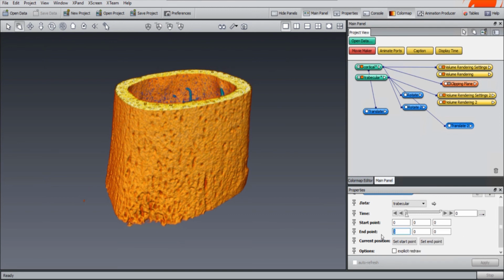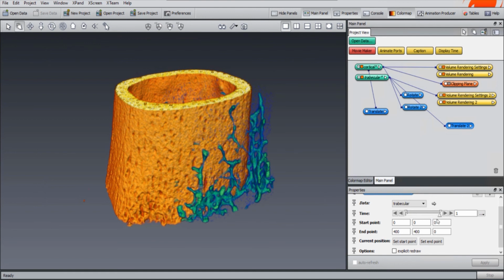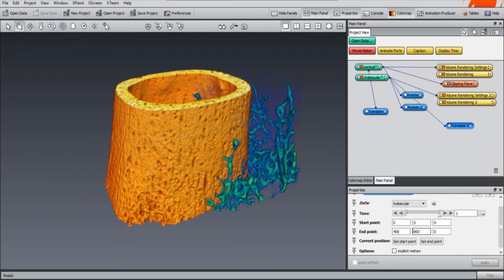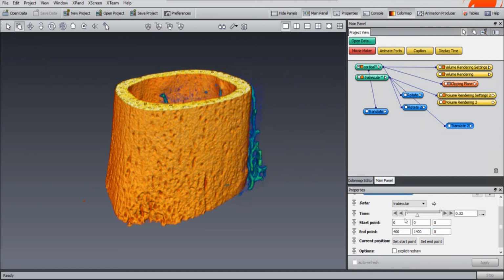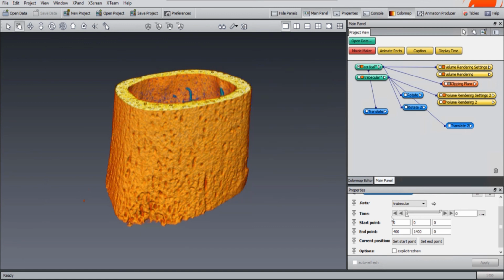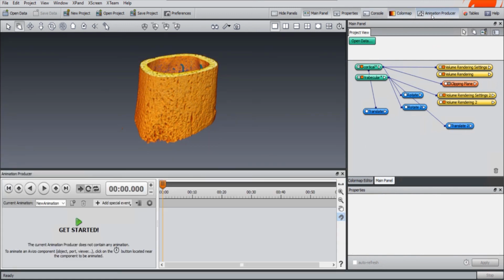this one, let's say, to the left. Let's see if this one goes to the left. Okay, it's coming this direction. Let's make another on the Y, and then it goes more or less to the right. Okay, now we can start creating the video.